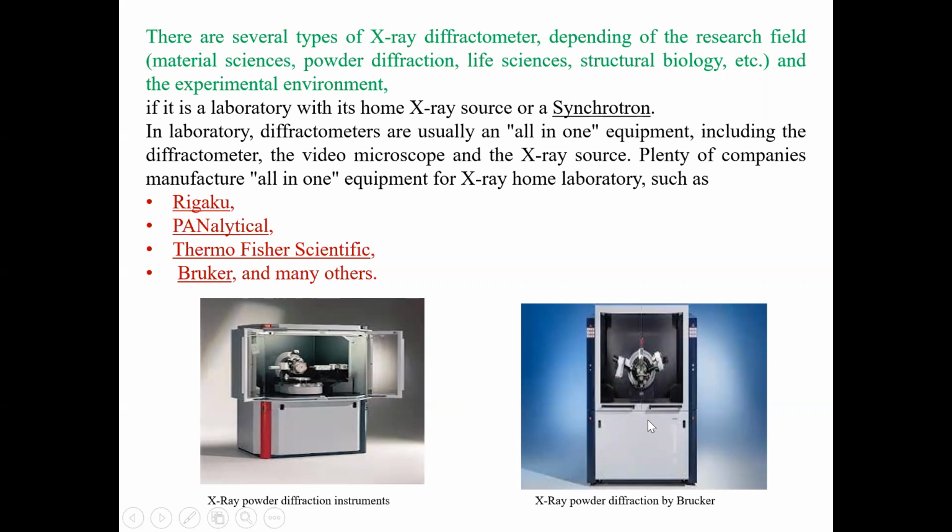So if it is a laboratory with the home X-ray source or the synchrotron, laboratory diffractometers are usually all in one. हा जो ऑल इन वन असायला पाहिजे तो म्हणजे ब्रुकरचा असतो, अँड दिस काइंड ऑफ इन्स्ट्रुमेंट्स वी आर युझिंग टू इन द रिसर्च फील्ड्स ऑफ केमिकल सायन्सेस अँड द physical sciences.